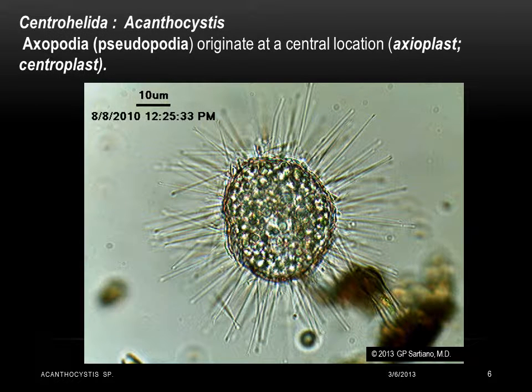The pseudopodia of Acanthocystis are known as axopodia. They originate at a central location in the cell, the axioplast or centroplast.